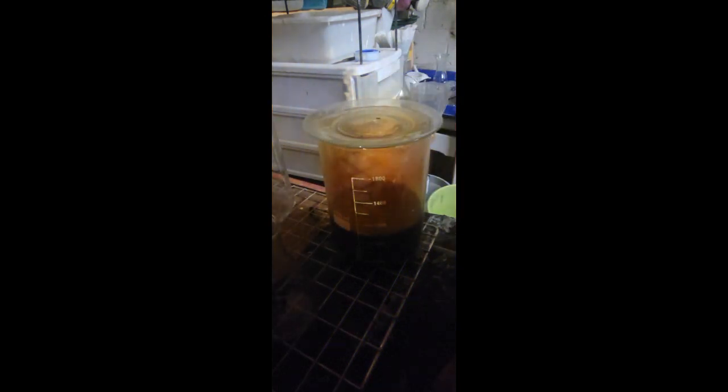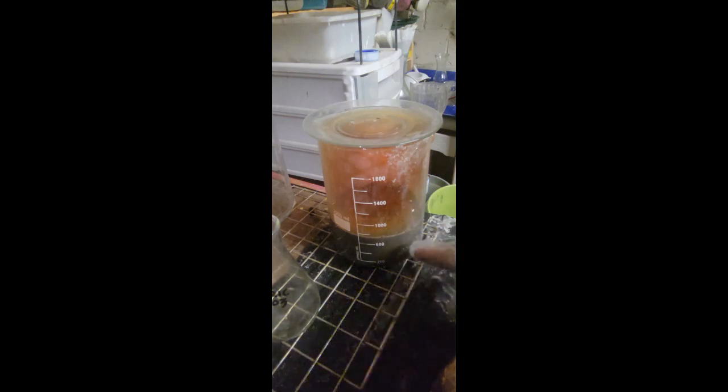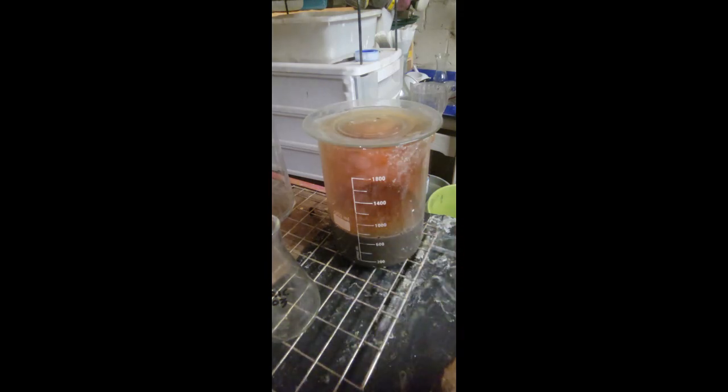Give it a little mix. Cover it up. Let it sit. What you're going to see, the acid that has been introduced into our solution now will dissolve all this silver, and when it's completed, the solution will be a blue color. Okay? I'm going to stop this right now. I'm going to put on hyperlapse photography or video right now, and you'll see the transformation take place.